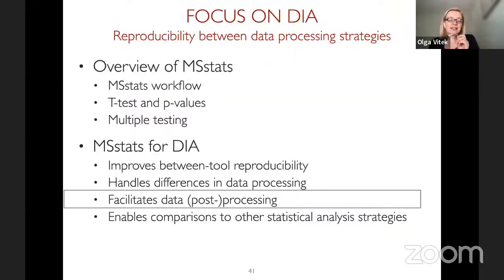So this is one vignette. So we can kind of work with the data processing matters. Some extent of outliers we can handle, in which case we have less differences between the tools. However, there's no magic, and some of the upstream data processing definitely has impact on our conclusions.